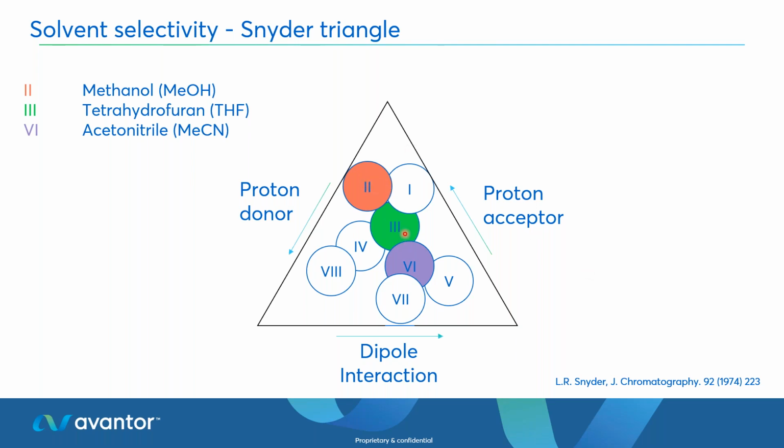But we've got good solvents in these three categories that are very good for LC. So we've got acetonitrile, methanol, and not as often used, and probably many of you will say not that nice to human health, is THF as well. But they do give us different properties and therefore different advantages when we want to move our peaks around. So definitely for method development. But if you're trying to substitute one for another, you'll see that isn't always the easiest substitution to do.